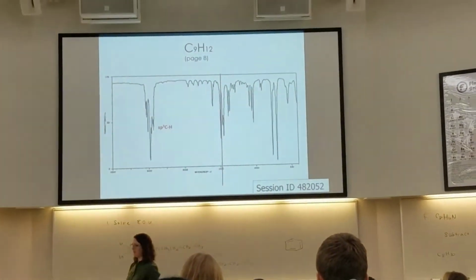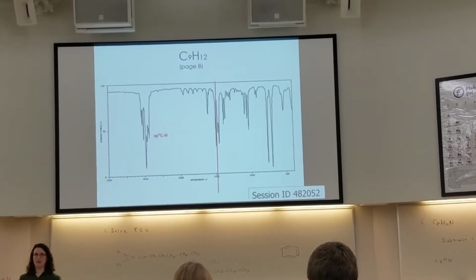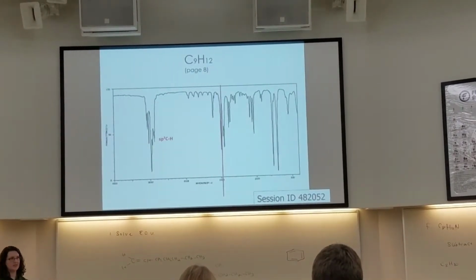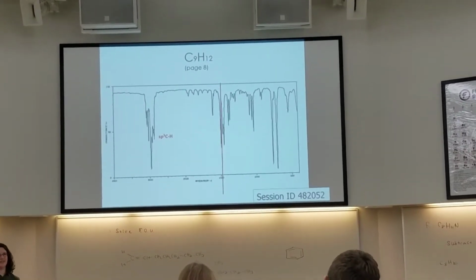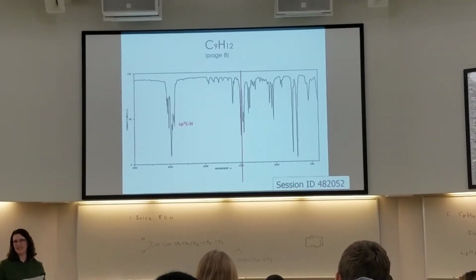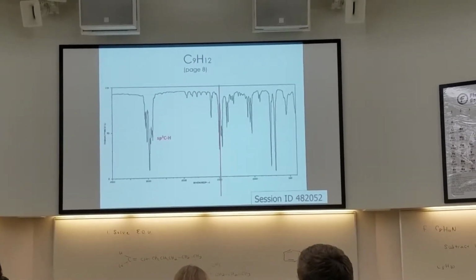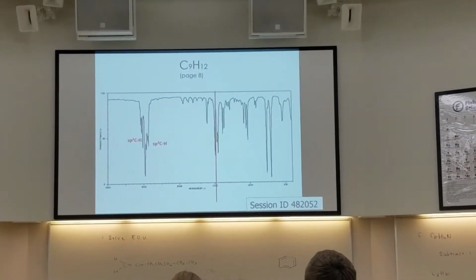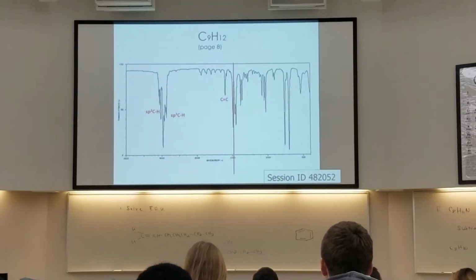So to be benzene, we have to look for a double bond, kind of the same area that we looked for in the previous spectra, right? Around 1600 wave numbers. Sometimes for benzene, it's just a little bit less than 1600, like 1590, 1580 wave numbers, but still, right around the 1600 numbers. Those are more carbon-hydrogens, but then that's the carbon-carbon double bond.